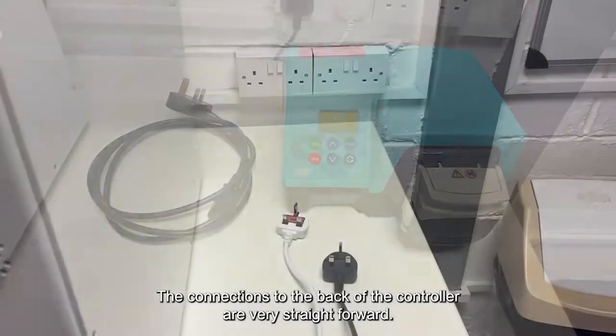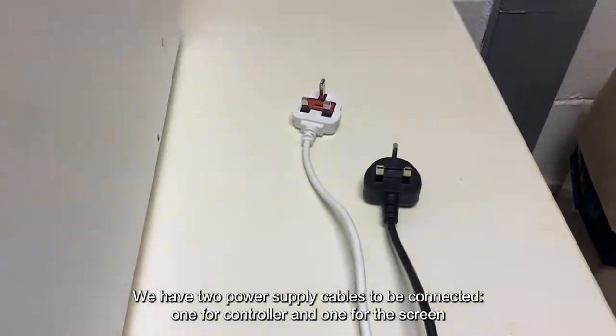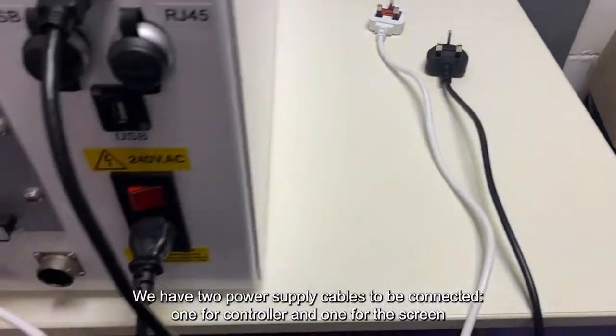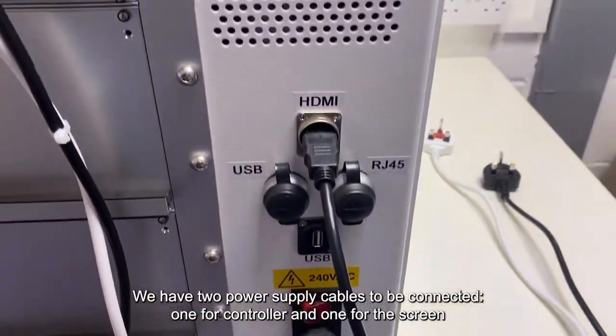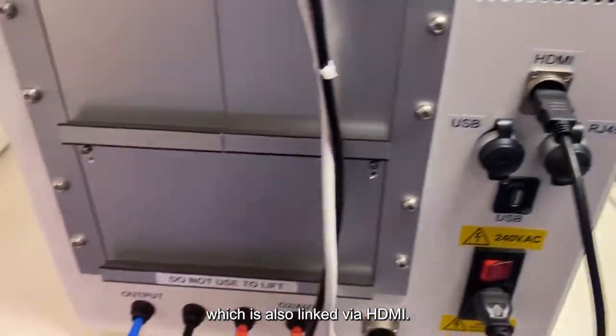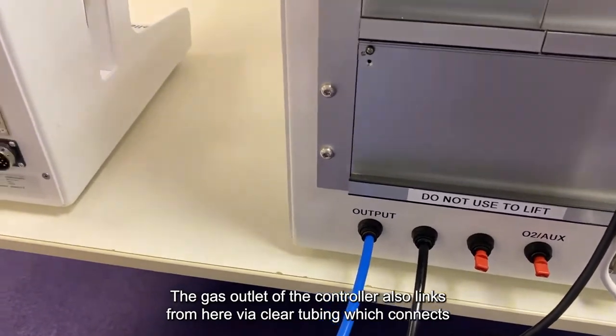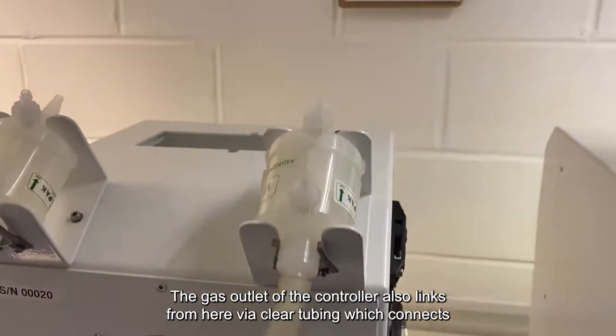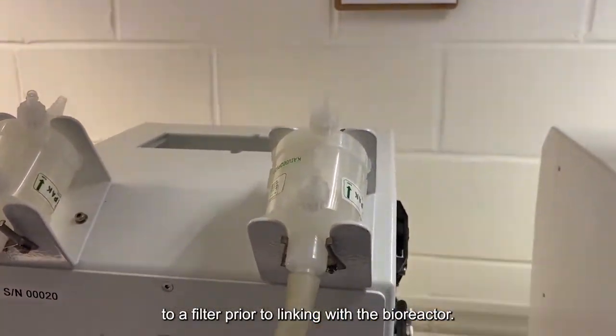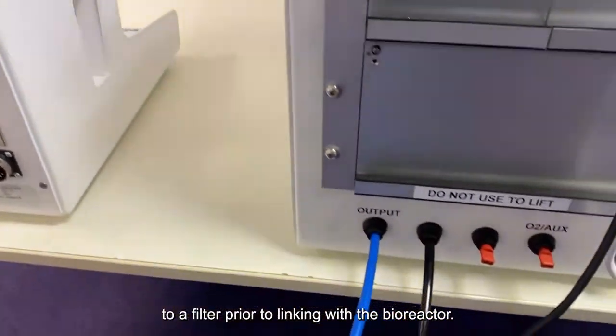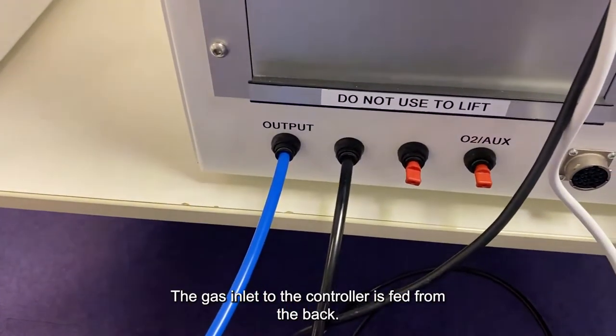The connections to the back of the controller are very straightforward. We have two power supply cables to be connected, one for controller and one for the screen, which is also linked via HDMI. The gas outlet of the controller also links from here via clear tubing, which connects to a filter prior to the linking with the bioreactor. The gas inlet to the controller is fed from the back.